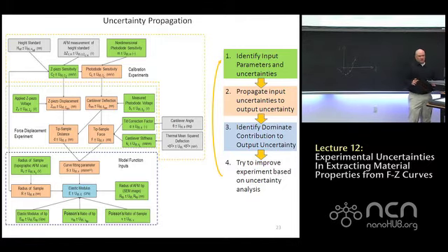And those are all what I've marked green, so I can define all those as inputs. We're going to go through that process I discussed earlier, which was using the curve fitting procedure, the DMT model, the data collection. So we do all that, and we get to our elastic modulus, which is blue. So what this chart represents is the interrelationship between those parameters.